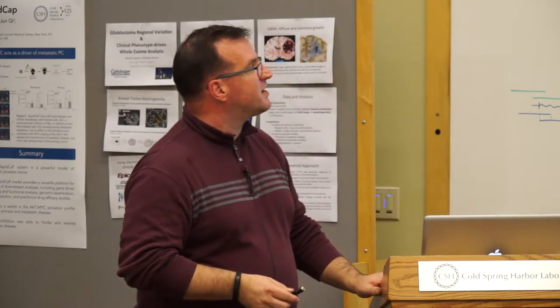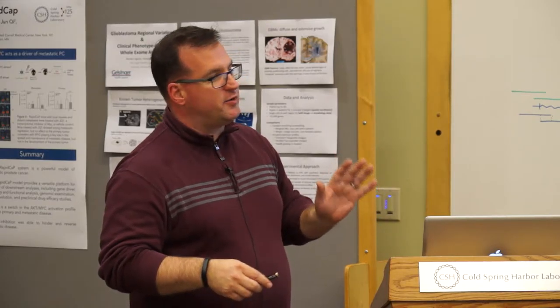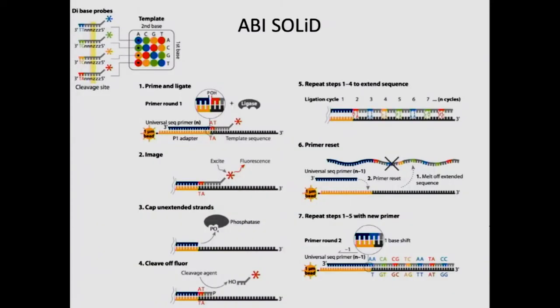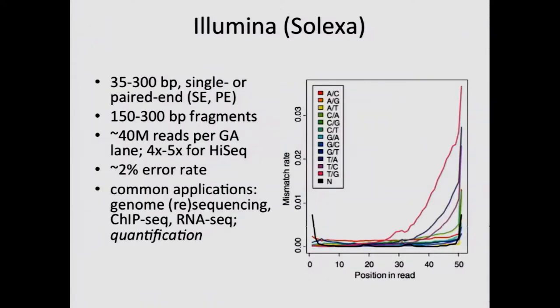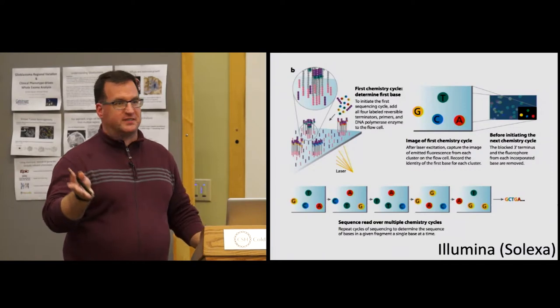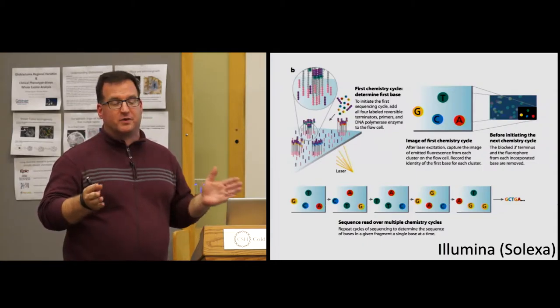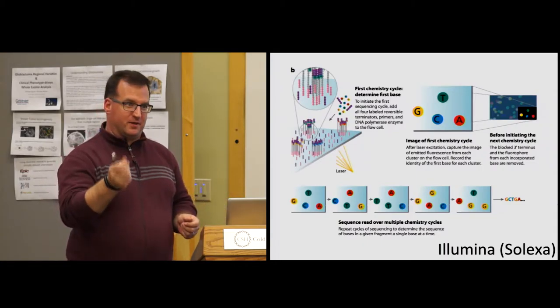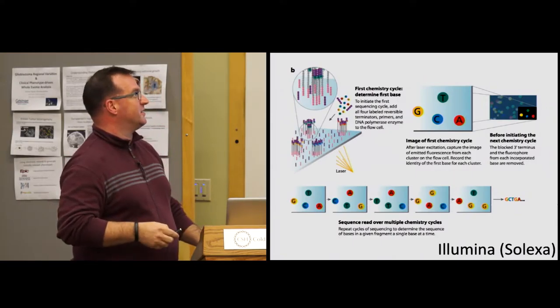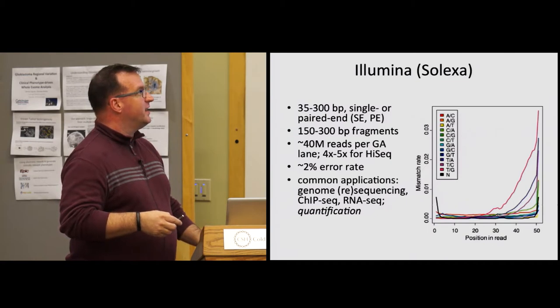Okay, real quickly, I'm going to talk about SOLiD, although I'm not actually going to go through all of it. But the take-home message with SOLiD, and this is a technology that does still exist, is that it's pretty rare. It is incredibly cheap. Illumina is expensive because of these fluorescently labeled nucleotides. Besides Illumina selling you the machine for a few gazillion dollars, every single time you run, you have to buy these reagents. It's kind of like the whole razor blade thing: you get the razor blade, but the replacement razors are the most expensive thing. So Illumina gets you coming and going.